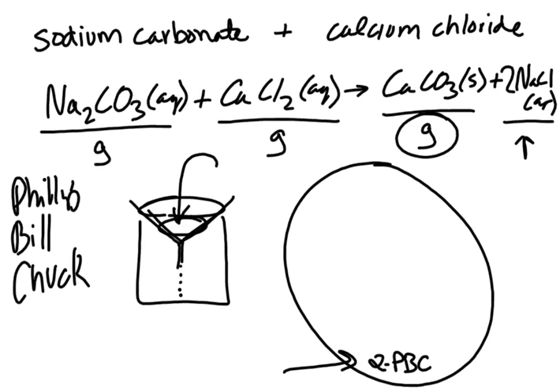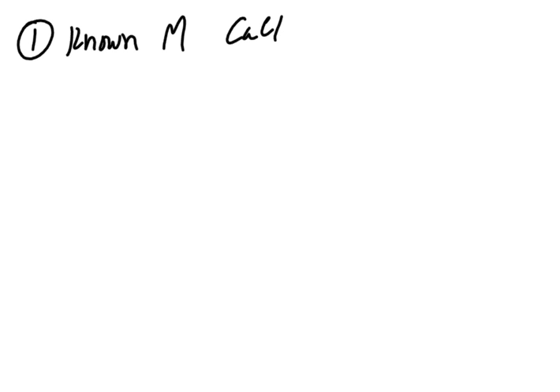So let's go ahead and go through an overall procedure. One, you're going to have a known molarity of the calcium chloride. Now, if you don't know what molarity is, make sure you go back and watch the molarity video.